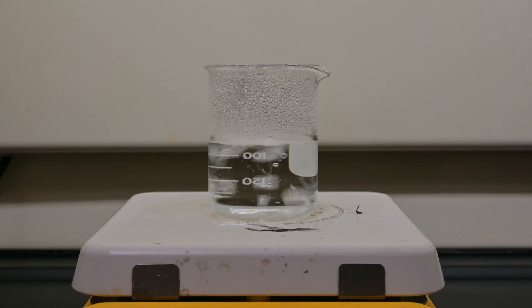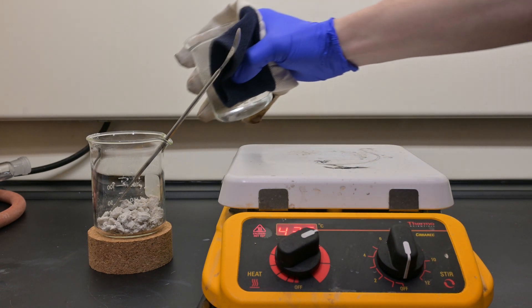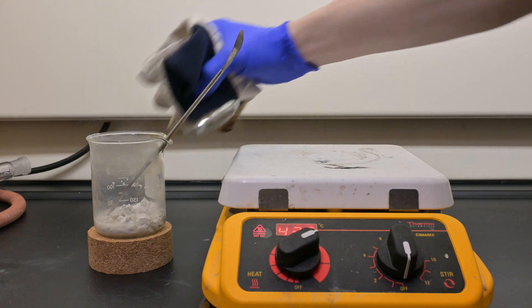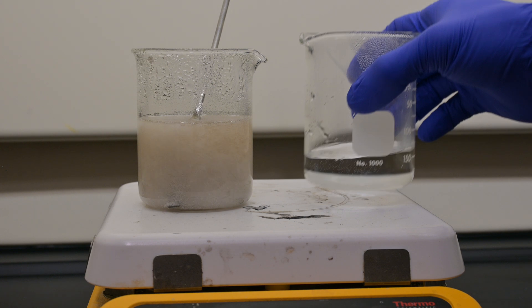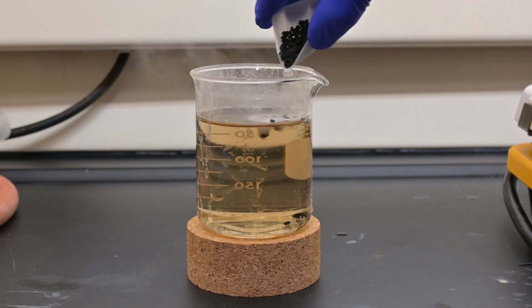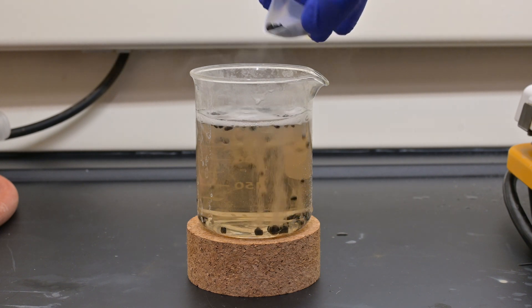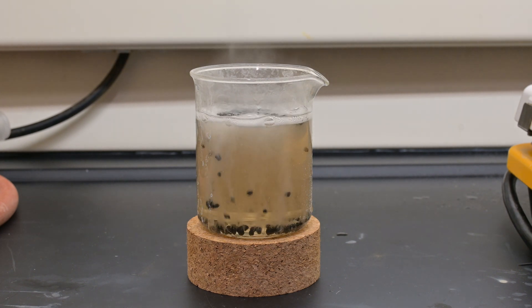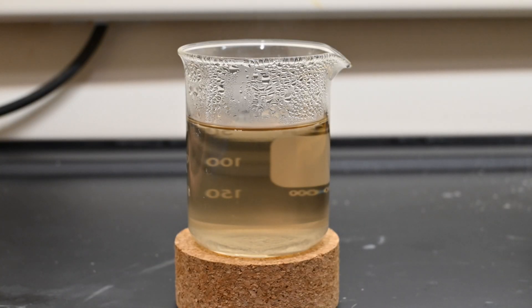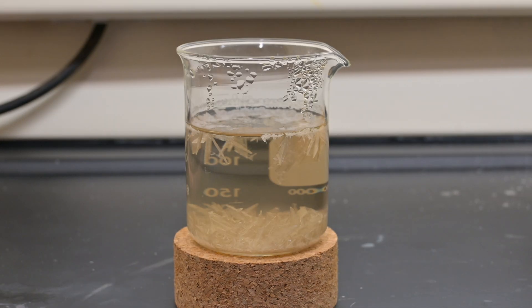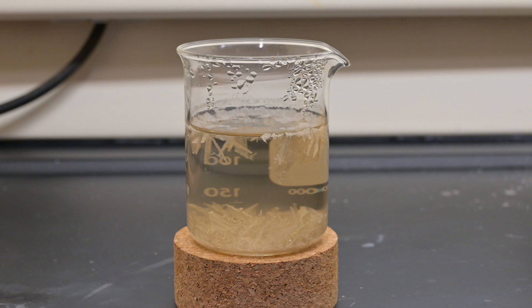To further purify our product, we dissolve the crude sulfanilic acid crystals in just enough water to achieve a clear solution. Then add 2 to 3 grams of decolorizing carbon. After that, we allow the solution to cool to room temperature. I like to set it on a ring cork to allow it to cool slower than it would on the bench. This leads to larger crystal formation.